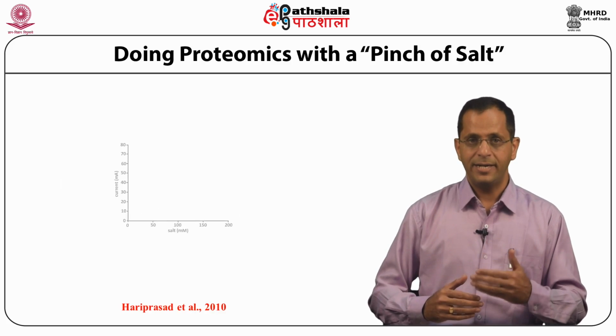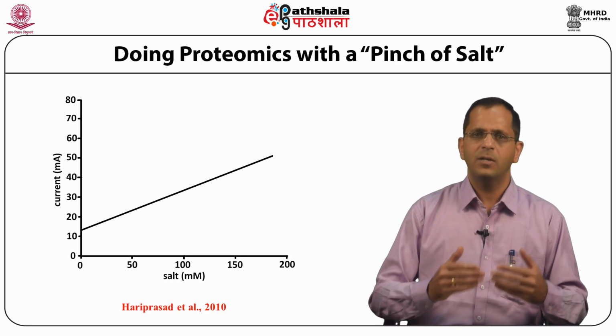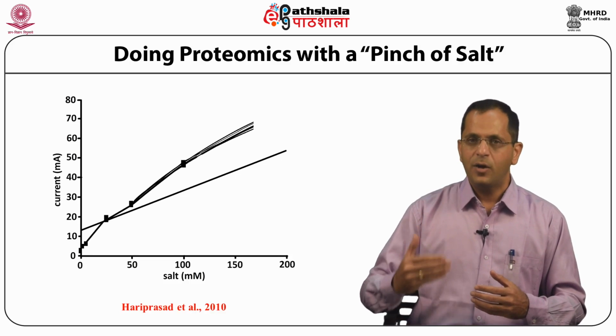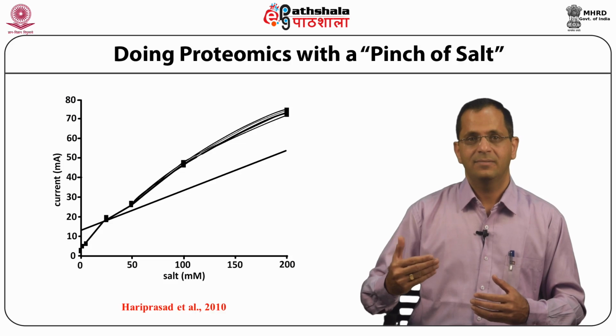We at our laboratory clinical proteomics facility have developed a simple cost-effective technique based on the fact that ionic impurities conduct more electricity.